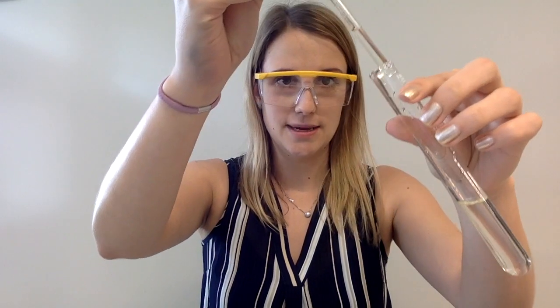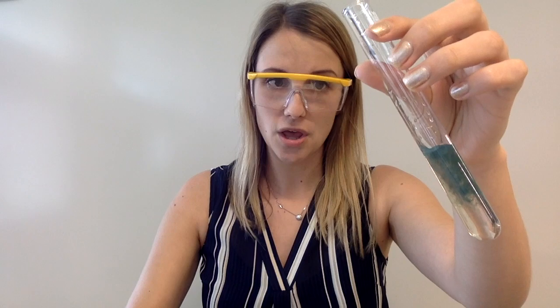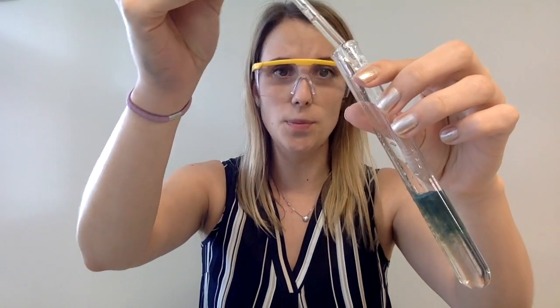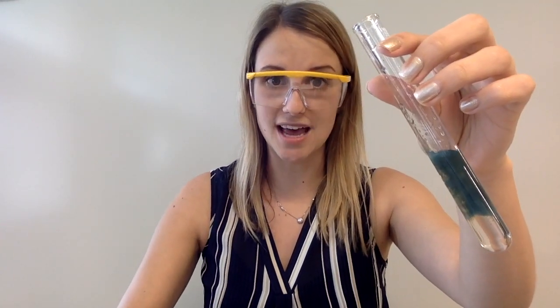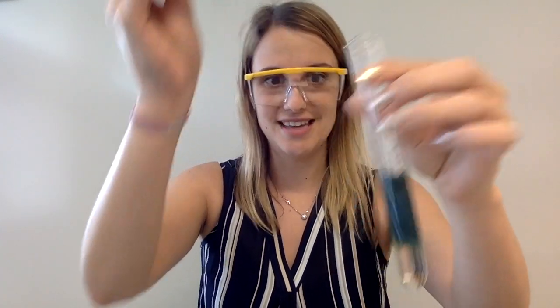Now with the ammonia, a fresh sample of iron 2 plus here, what we can see is that you also get that same green precipitate. So the observations are identical for sodium hydroxide and for ammonia. Both of them produce a green precipitate that is insoluble in excess.